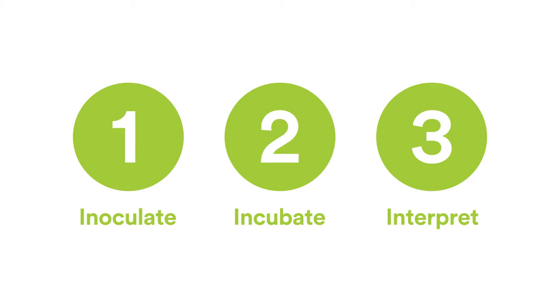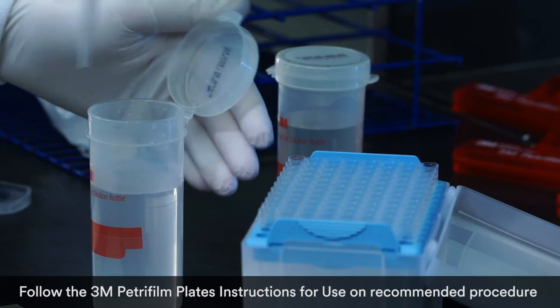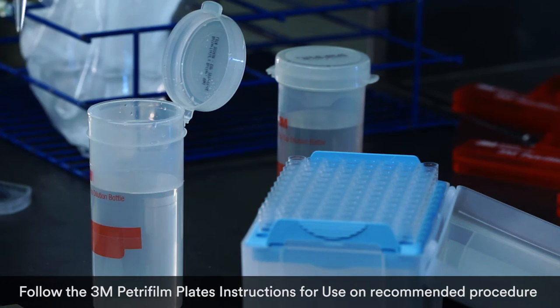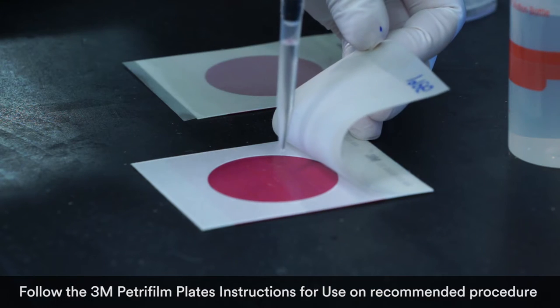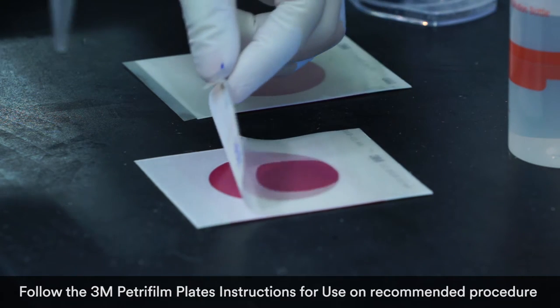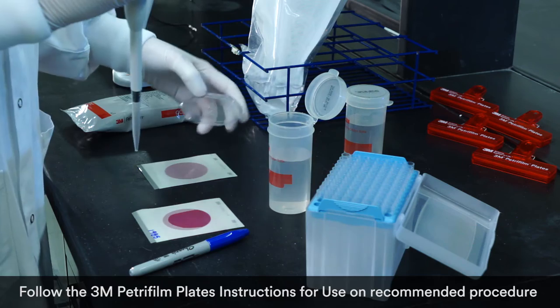With 3M Petrifilm plates there are just three simple steps to getting consistent, reliable test results. Step one: inoculate. Each slim pack of Petrifilm plates contains uniform testing media. Simply open the pack, take out one plate, lift the top film, and dispense one milliliter of the prepared diluent onto the center of the bottom film. No cumbersome, time-consuming agar prep required.